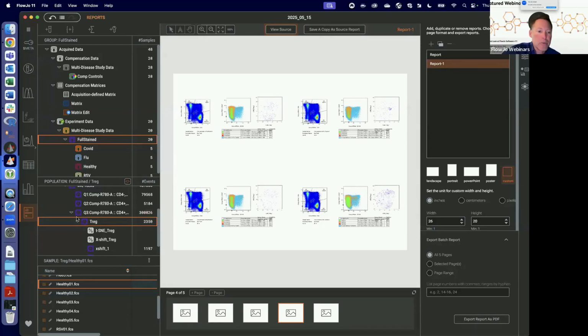Okay, let me do a super quick batch by population. I'm going to hit one more report and then we'll wrap this thing up.